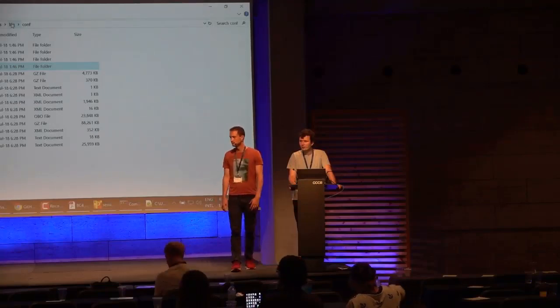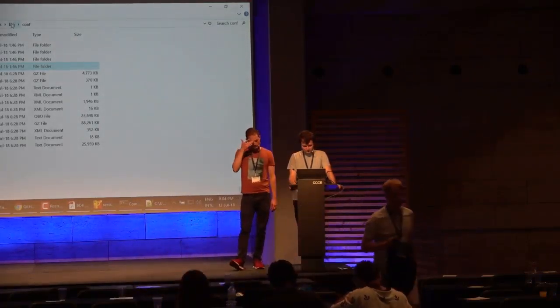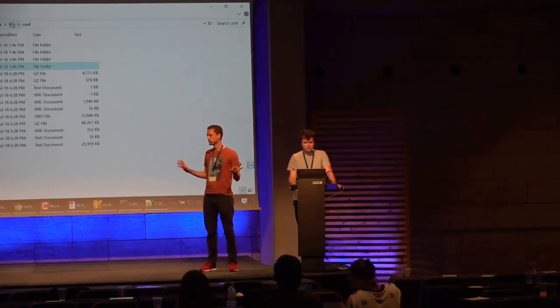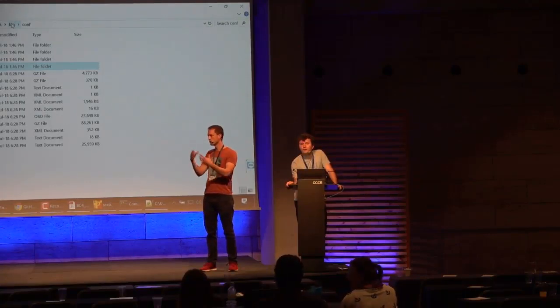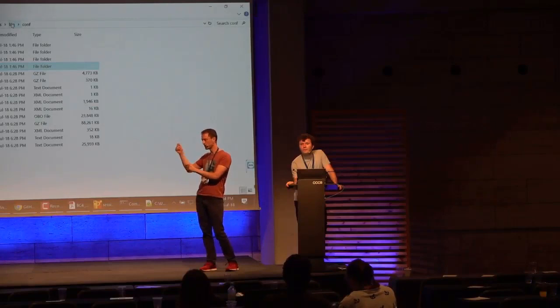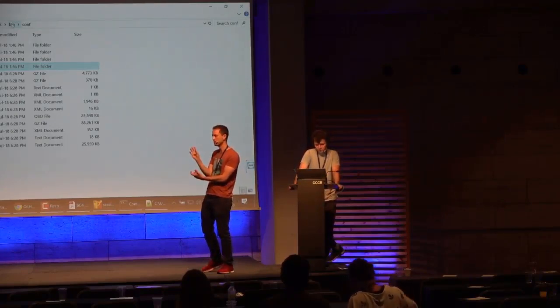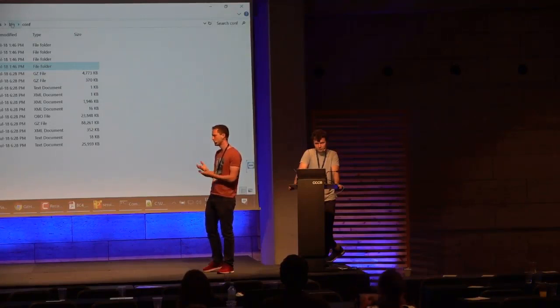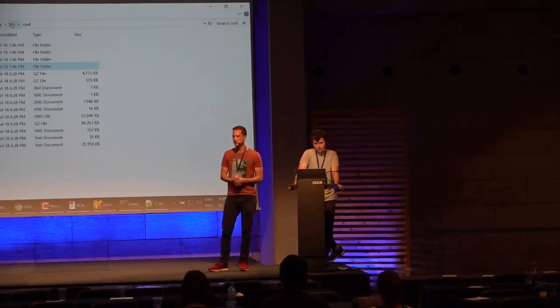So what's the reason why you have to import Pandas through Perseus Pi? Do other packages work for Python, like if you just import them? You always can do things however you want, right? You can write your own parsing code for the Perseus tables and your own writing code for the Perseus table. I just personally provide one easy way to do it, and that's using Perseus Pi and getting the Pandas version from there, which has these two magic functions added for reading and writing the tables in the Perseus format. It actually also has the same functionality for networks, not using Pandas, but using some other libraries. I think that at least for me was the most reasonable approach. But contributions to these libraries are welcome. So if you have some idea about some library you want to use, where you're missing the connections, then let's talk about that.